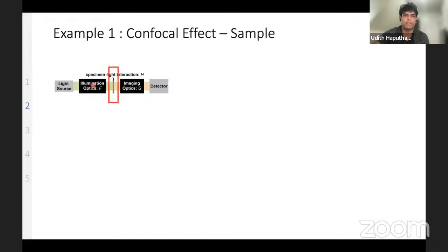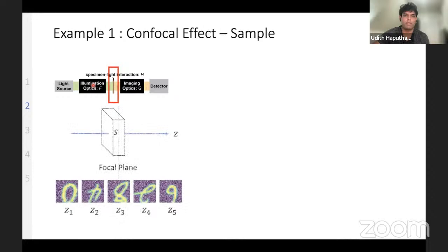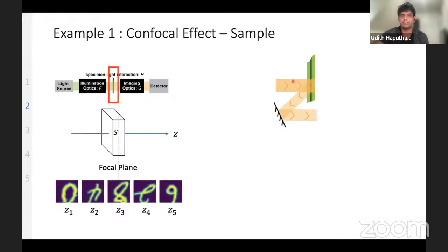For the specimen light interaction, the illumination optics light intercepts with the sample, and the reflected light, we have a mirror there, will be fed into the imaging optics.